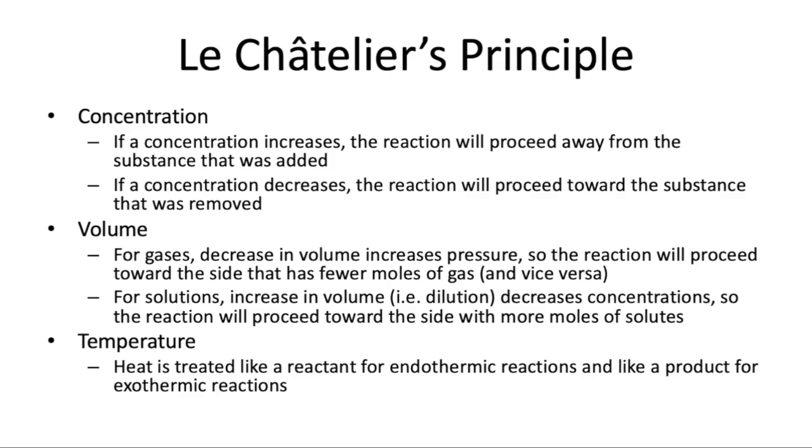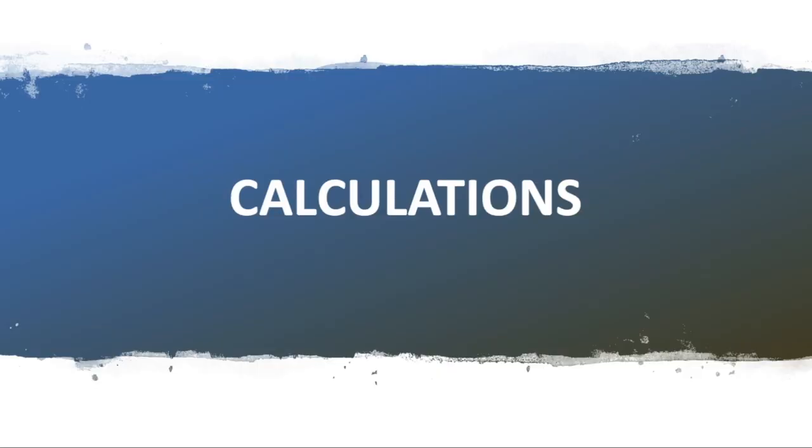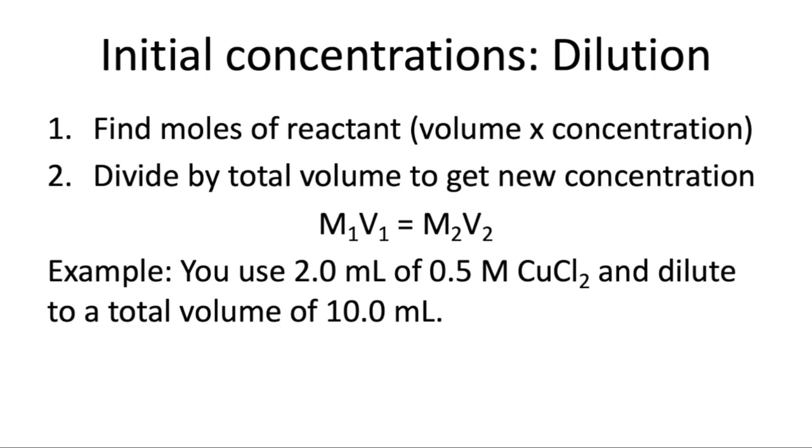The reason I'm going to spend a little bit more time on the calculations is because you're going to be asked to analyze some data from a similar experiment to the one that you're doing, but one where we were able to measure the absorbance of the product of the reaction. And so we have quantitative data as opposed to just qualitative data about which direction the reaction proceeds.